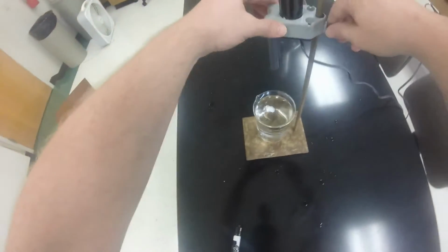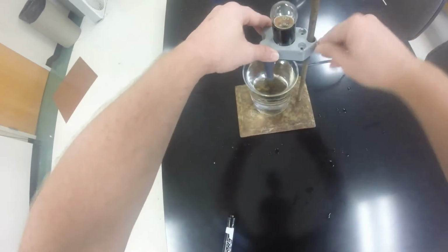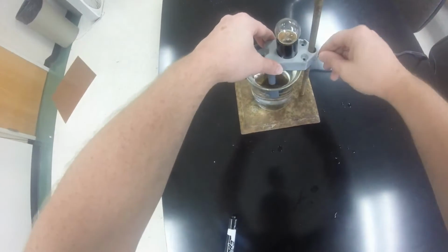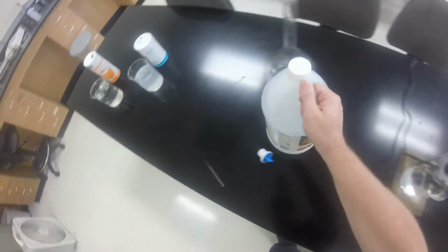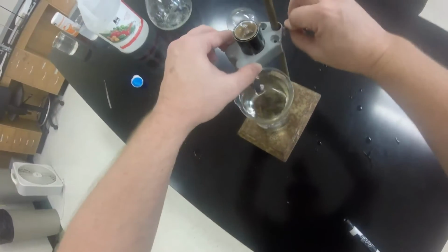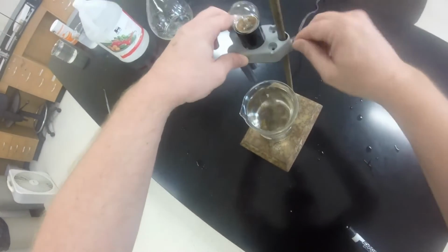Alright, so we're going to lower our light down into this weak electrolyte. Oh, I don't know if we added enough. We may have to make our electrolyte a little stronger here, so let's maybe not add so much distilled water.